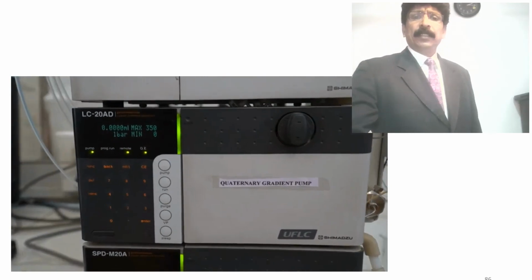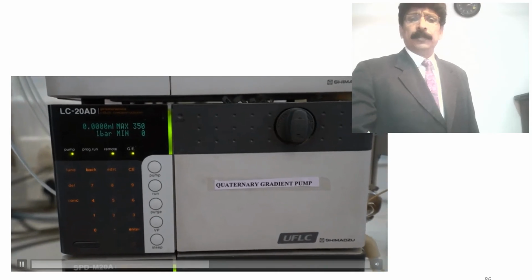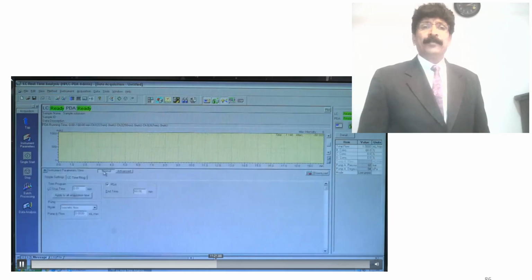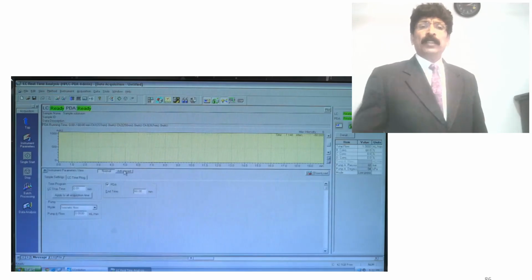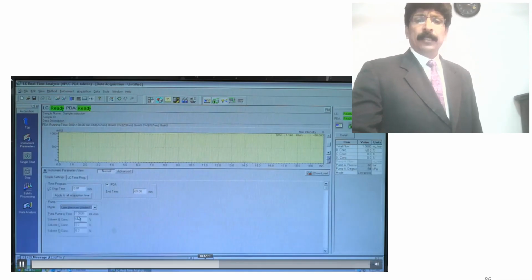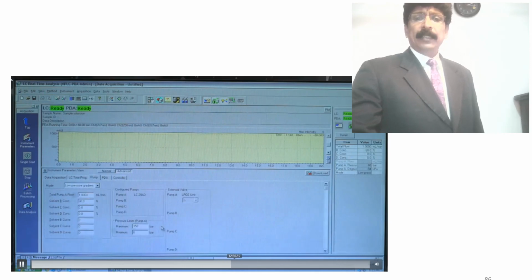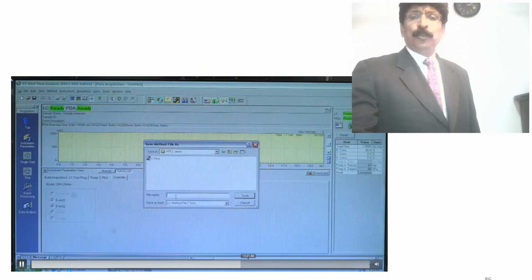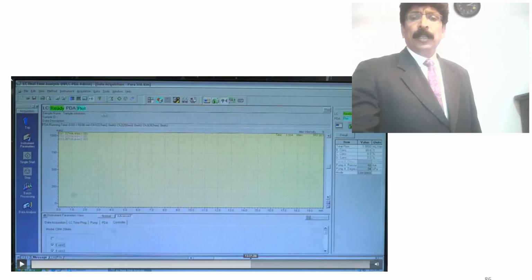Now you have to see the pressure control, and after that you can see whether the movement of the solvent system is proper or not. Is it normal? You have to give the instruction by the computer. And now we are going to take the samples. Which sample you are going to do, paracetamol, everything you have to do. And now you are going for the injecting area.